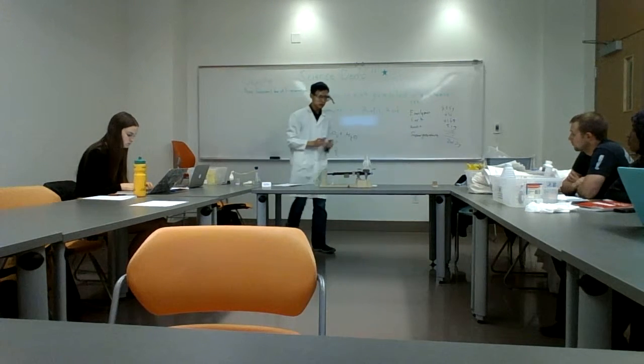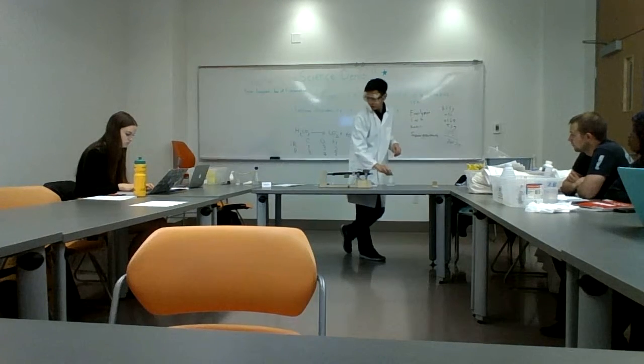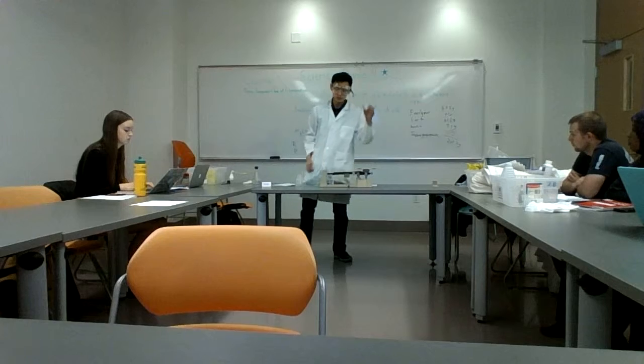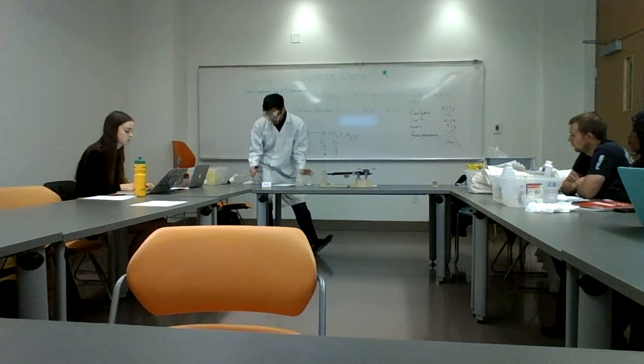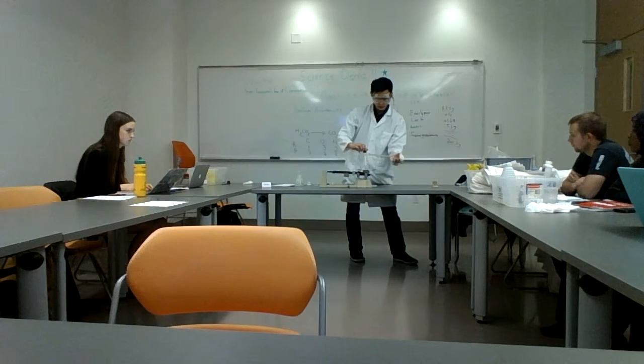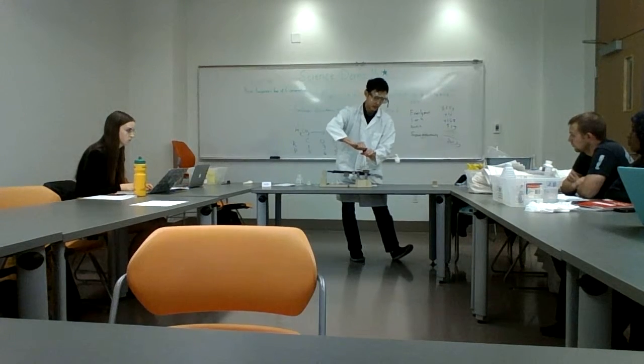All right, so let's do this experiment one more time. I did an experiment. This is 5 grams of sodium bicarbonate, and we also have here the vial and a balloon attached to the end of it.